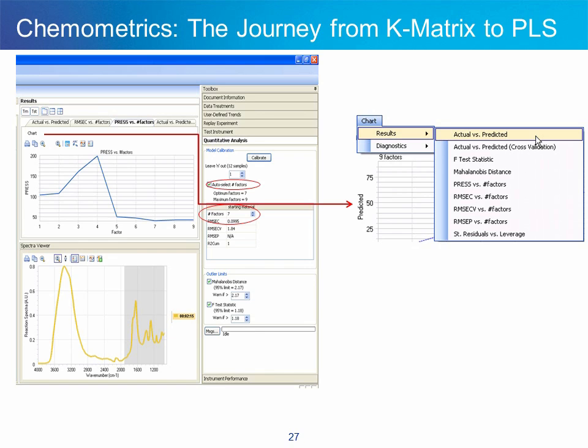In the next installment of this series, we will look at IC-Quant's features in depth with respect to factor selection. IC-Quant has an auto-select feature that will choose the proper number of factors for the user. However, this result can be checked and modified as necessary by using a variety of tools in the Results and Diagnostics menu.